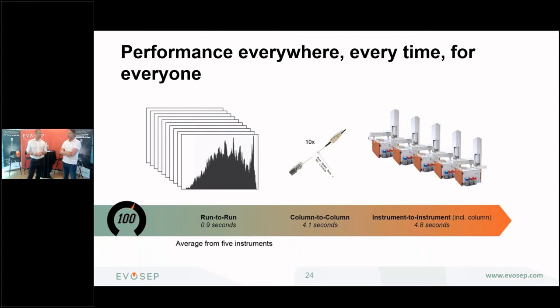Absolutely. But also for workflows, right? DIA is what a lot of people are doing today, and to get the ultimate depth and also this throughput, having a very reproducible platform is super important. And I think it's fair to say that we've seen data from both Thermo and Bruker with DIA-PASEF and the DIA approach showing not only great depth, but also really reproducible data sets. Something that has really increased since last year. It just makes it so much simpler to perform.